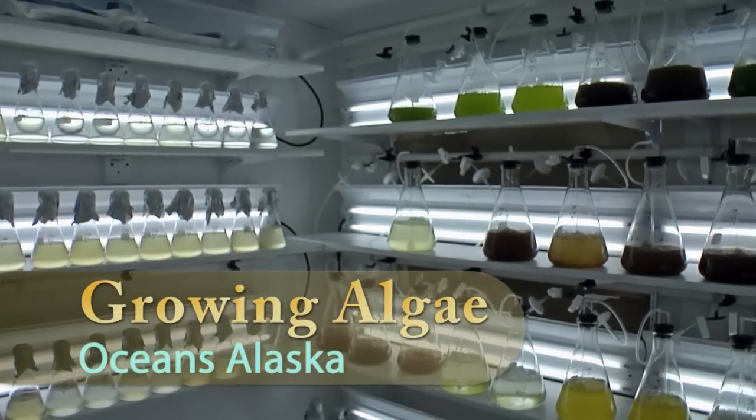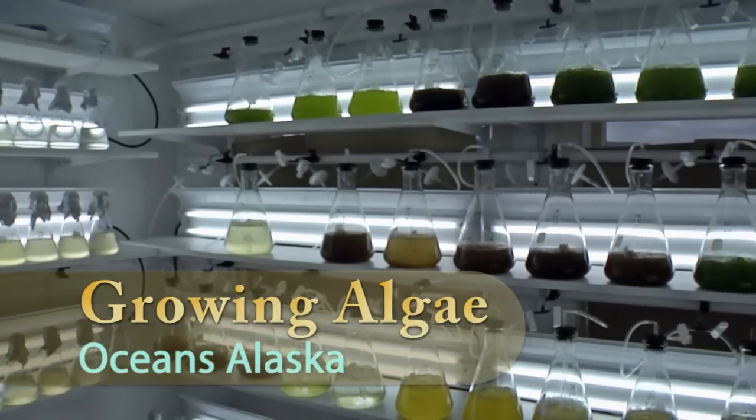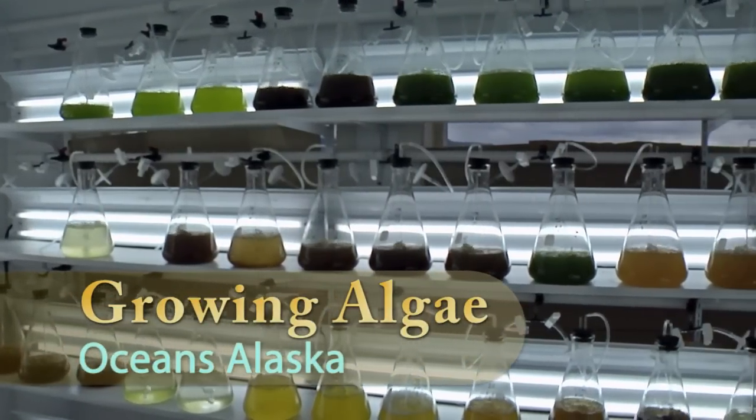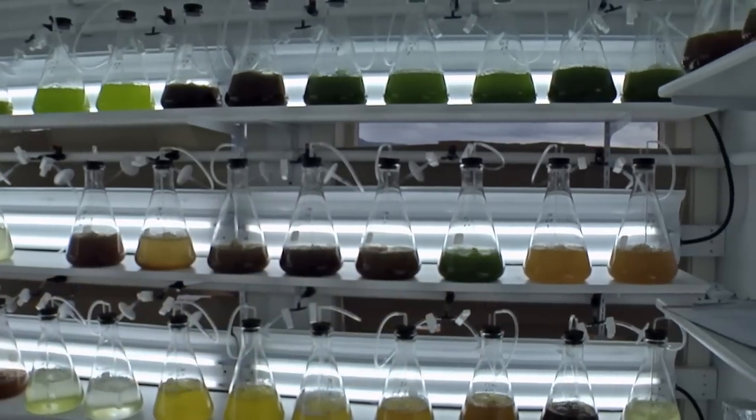This is the algae room, and this is where we are growing algae to be able to feed the oyster seed and geoduck seed that we're raising.